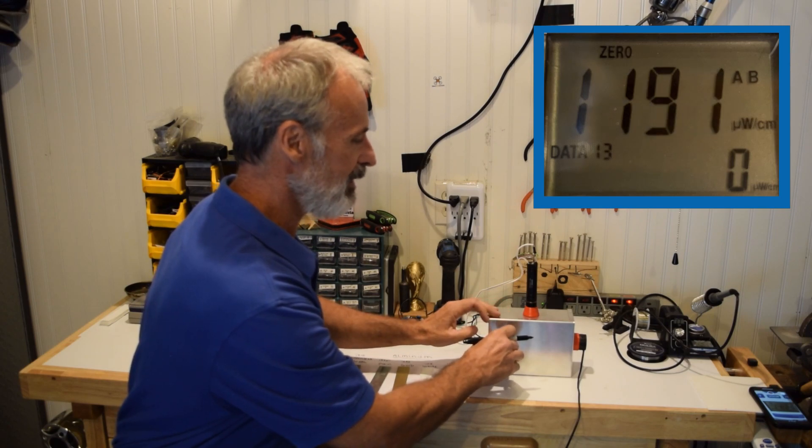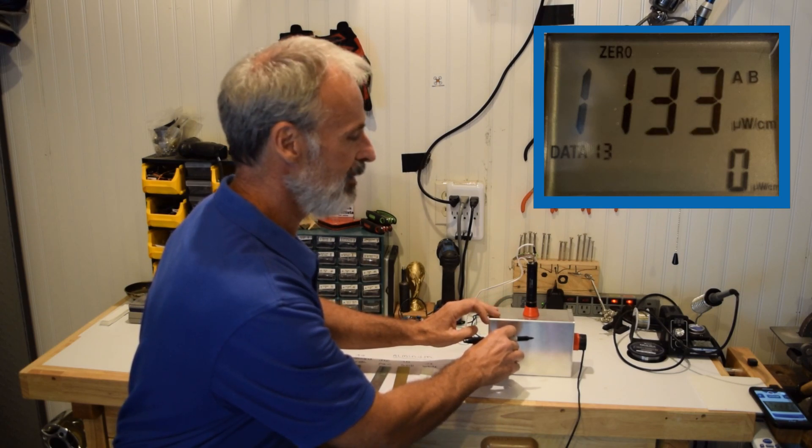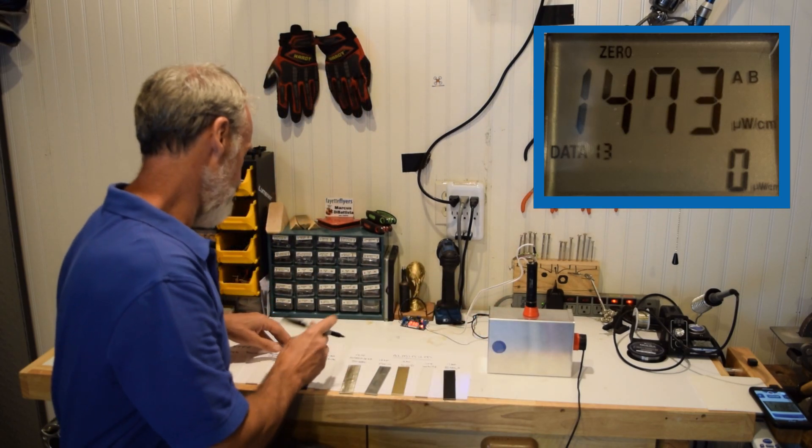So here's black ABS. 1,135. So you can see it's a little bit worse.